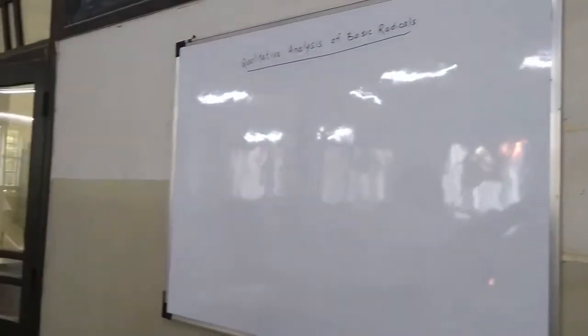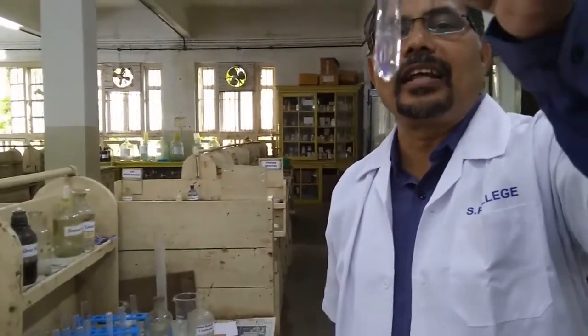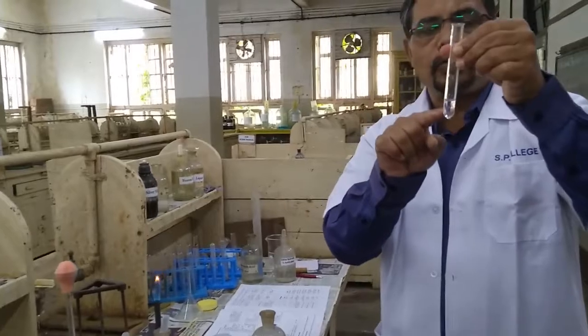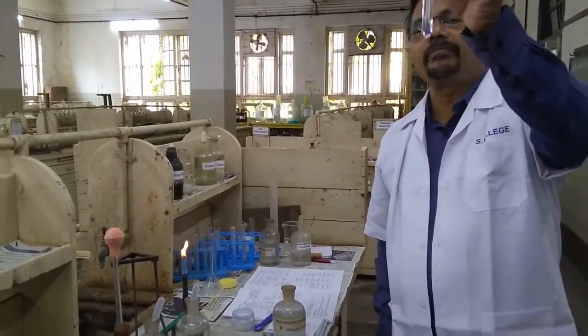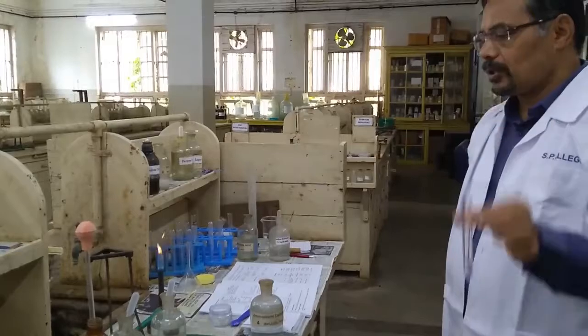See, this color of red litmus paper becomes blue. So this indicates the alkaline solution. What I had added here was original solution plus NH4Cl plus NH4OH till alkaline, meaning the red litmus paper becomes blue. So in this way I had prepared the alkaline solution.